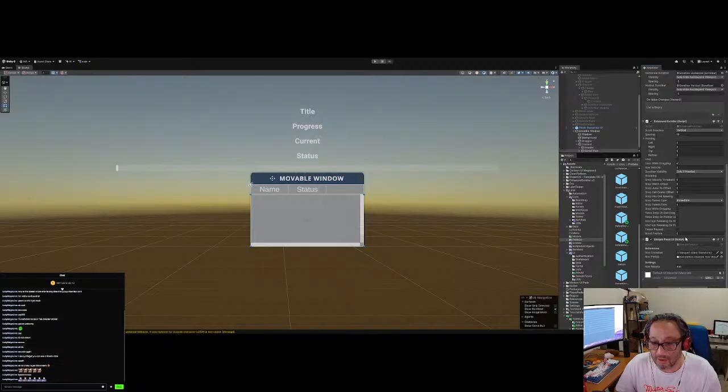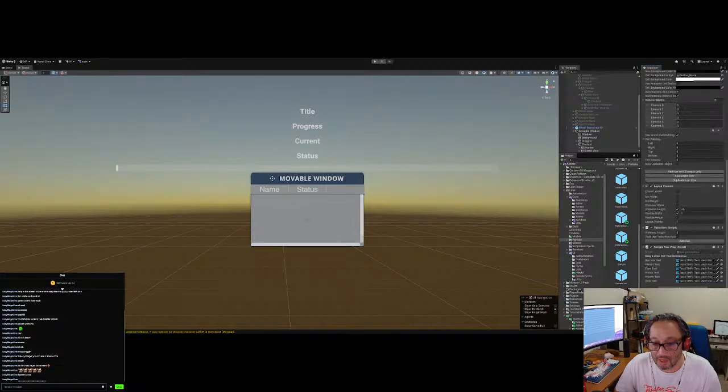Now we add the sample panel, but we also have to do a prefab, and the prefab is actually just the header. You can just rename it, and then add a prefab script to it so you can get the data in there, and that's what we did here.